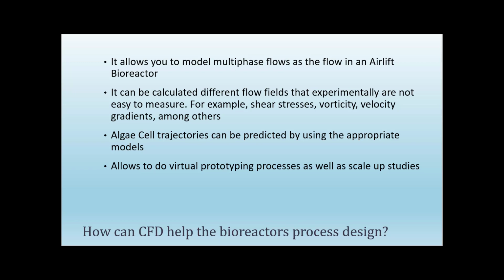In the same way, algae cell trajectories can be predicted by using the appropriate models. Finally, using CFD allows you to do virtual prototyping processes as well as scale-up studies. This helps the design divisions to accelerate their processes.